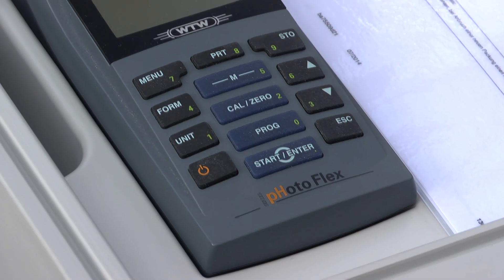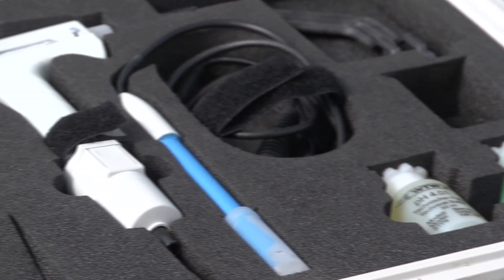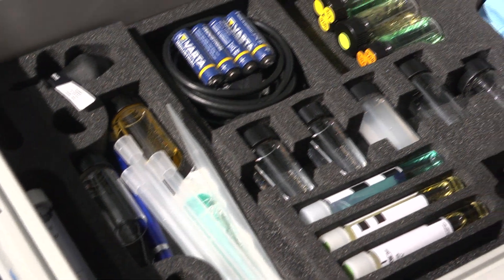For field measurement, a portable lab like this is very handy. It contains everything one needs for testing. This colorimeter uses less power due to the LED optics. Here are pipettes, a pH probe, test tubes and all sorts of accessories, like batteries, a screwdriver and several vials.